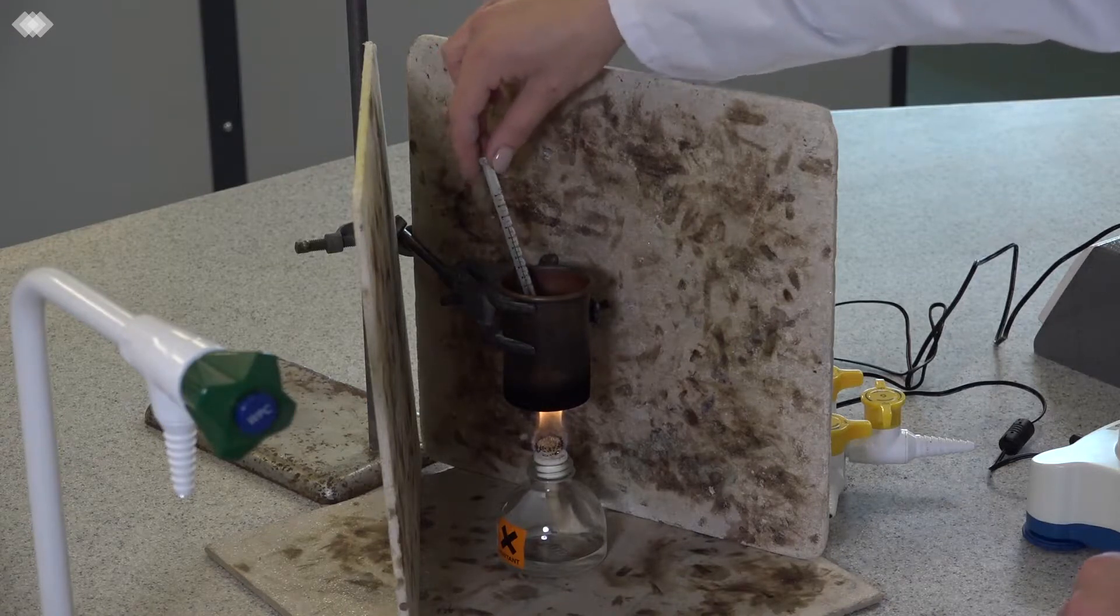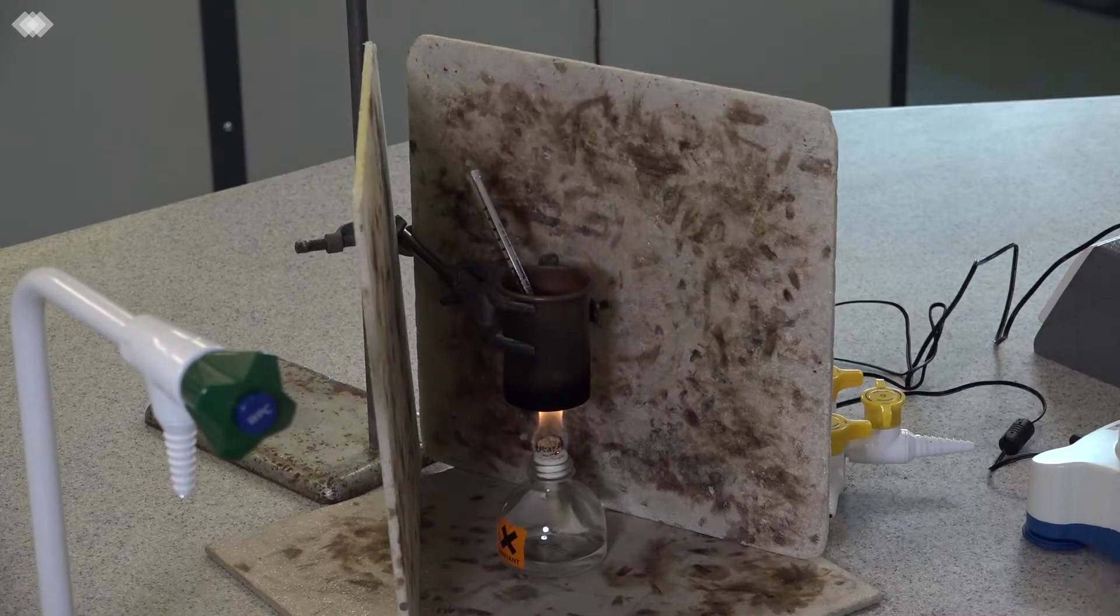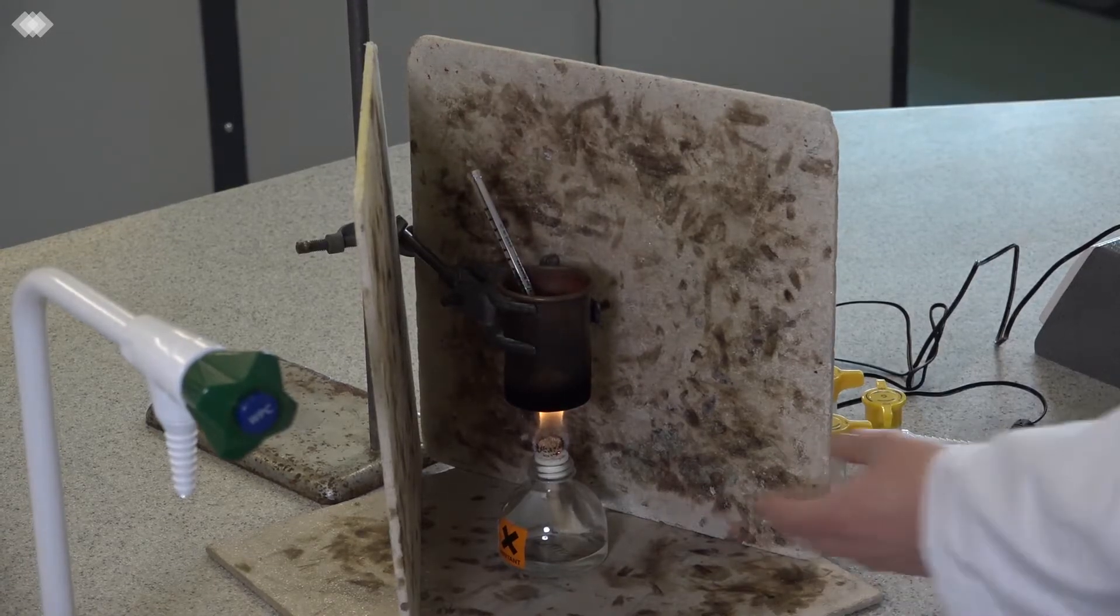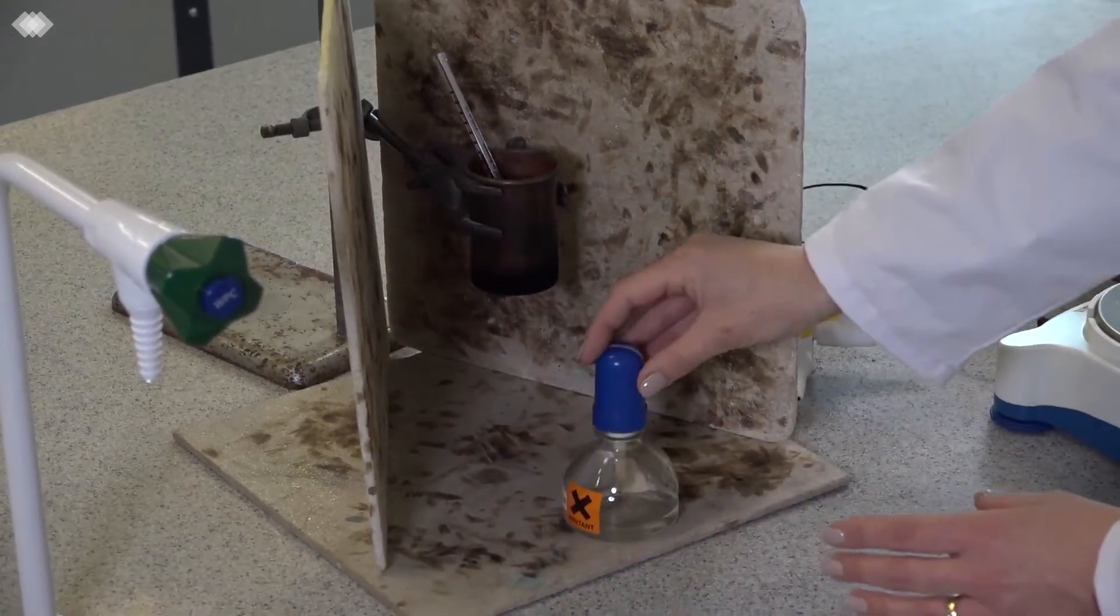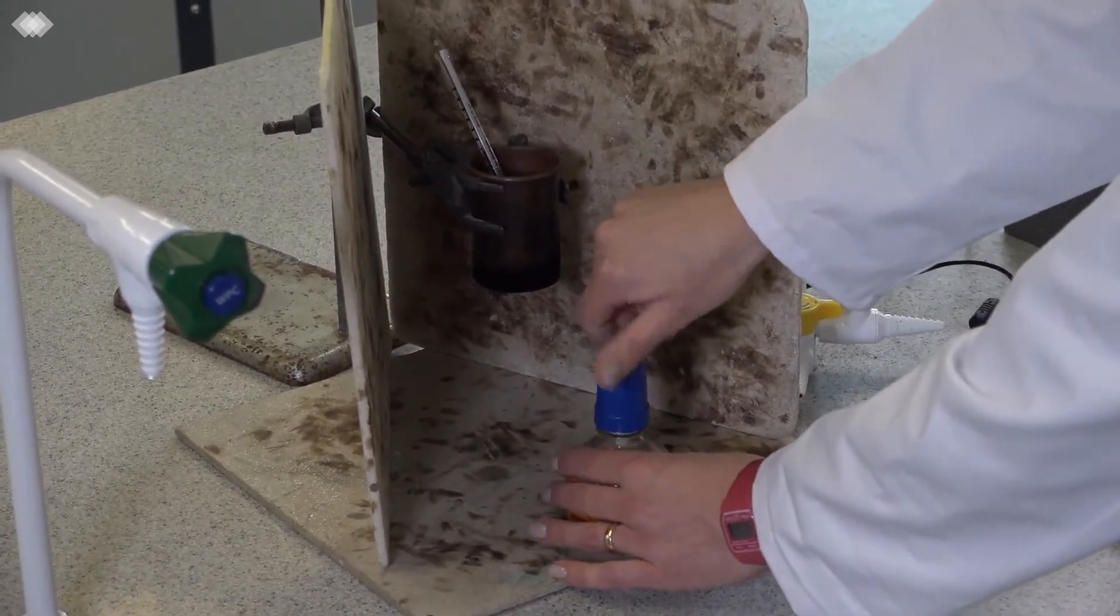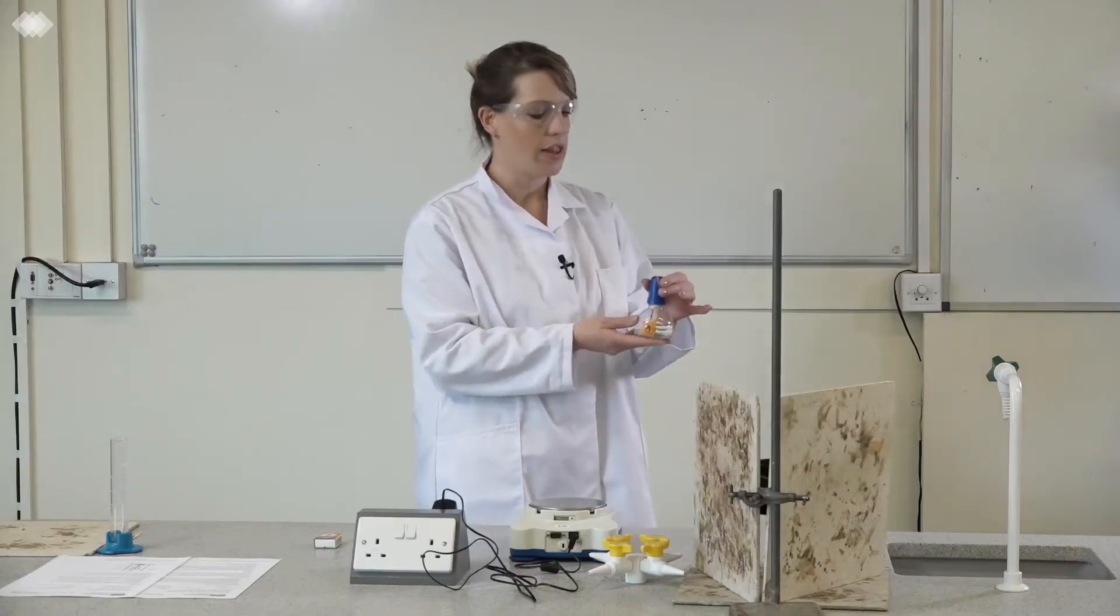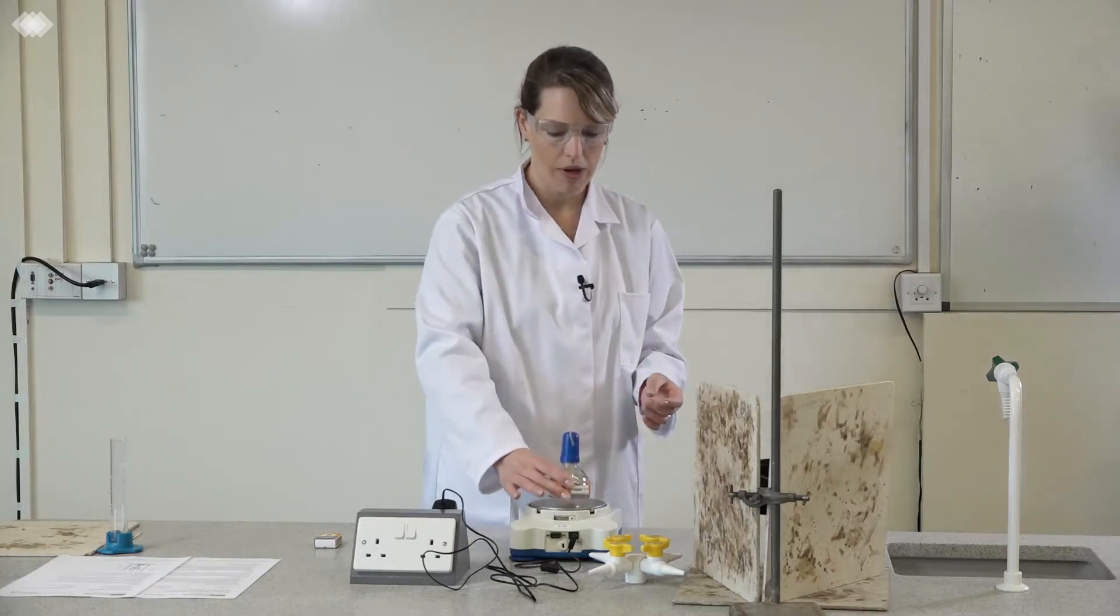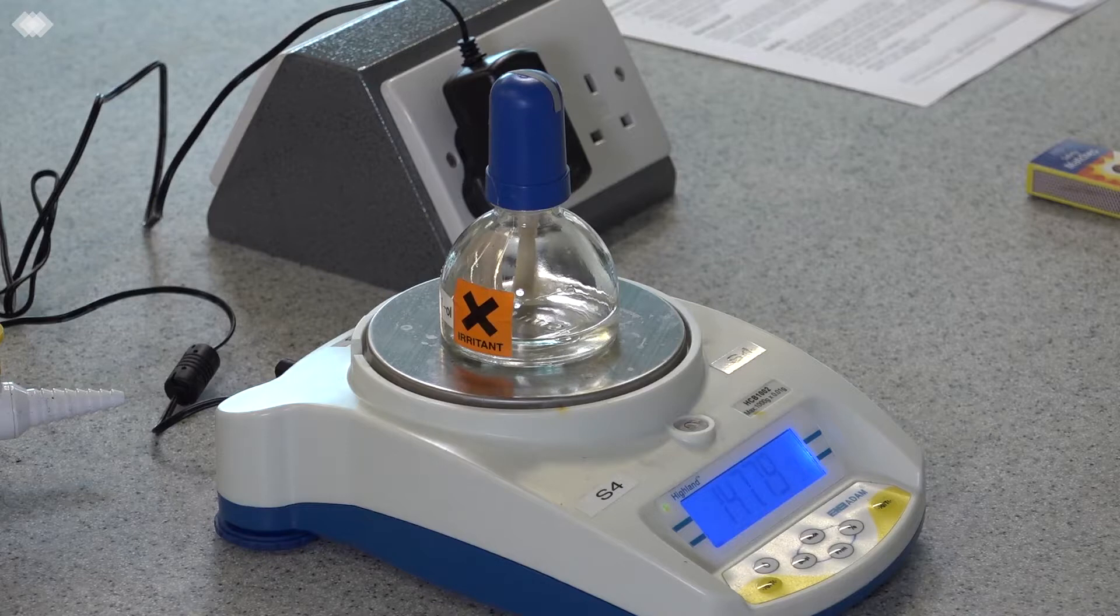Now the temperature has increased by about 50 degrees so I can stop heating. In order to extinguish the spirit burner, take the lid and put it straight over the flame. You have to do it very quickly so it immediately excludes the oxygen and the flame goes out. Then re-weigh the spirit burner with the lid on and record the mass.